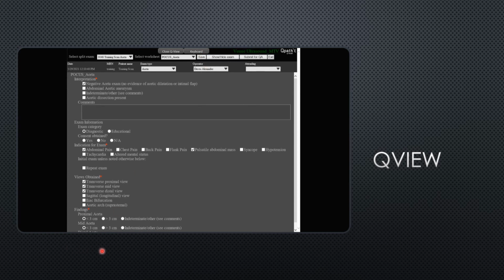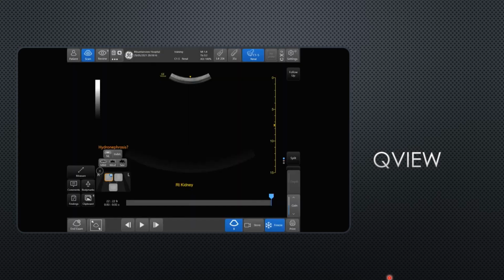And then what you want to do from there is there's an extra button up here now that says sign as, and you want to click that sign as button and enter your 3-4 and your password, and it will actually sign it. You'll actually be able to see up here it'll put a little pen icon with your name saying that you signed it. Once it's signed, you have to do that for each individual worksheet. Once they are signed, that goes into my queue to review it and to give you feedback on it.